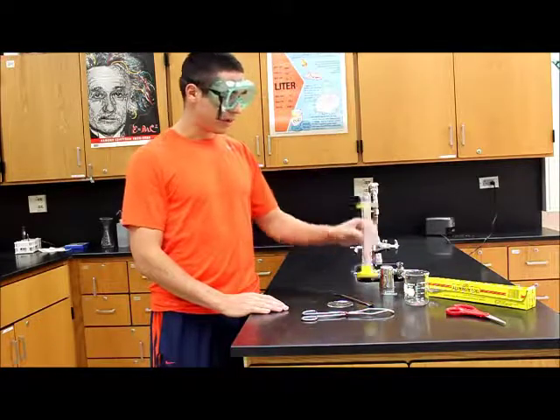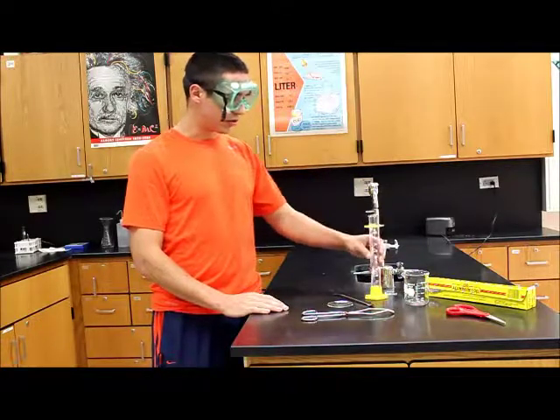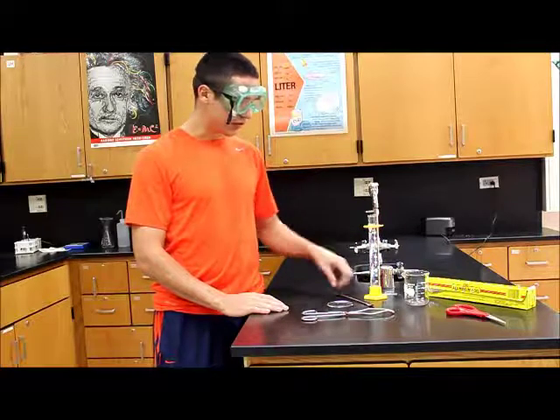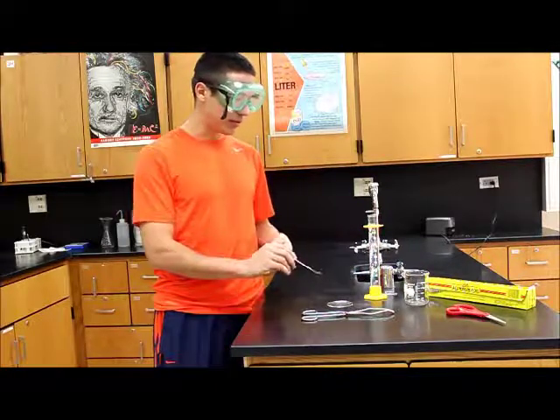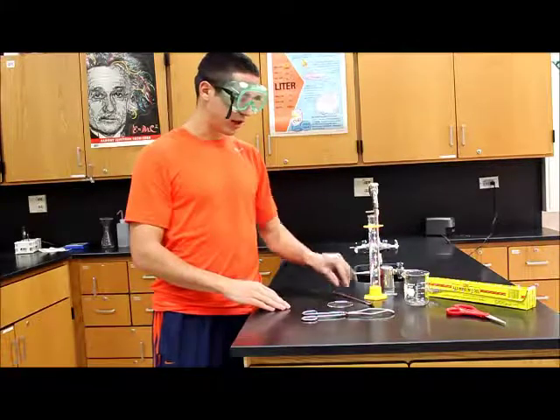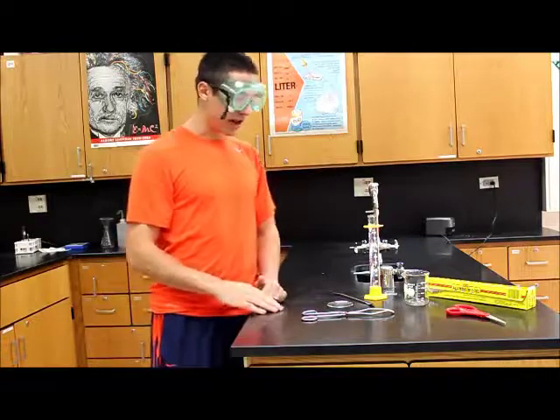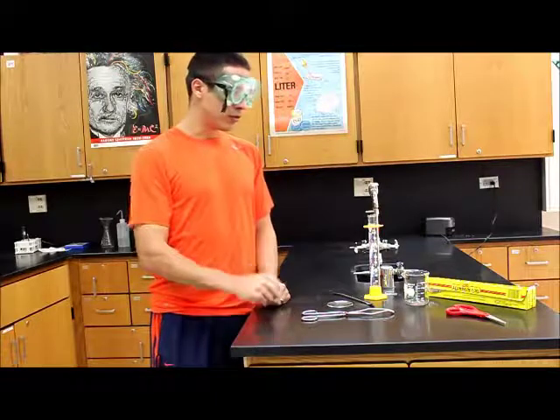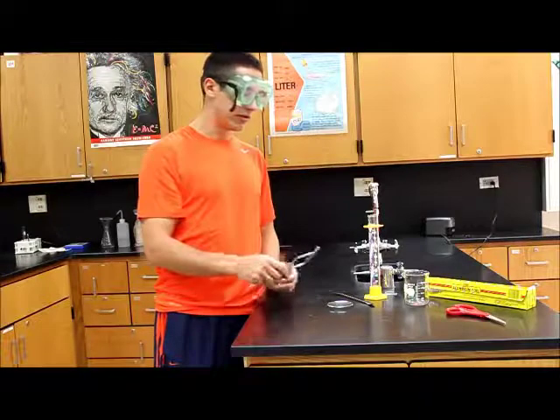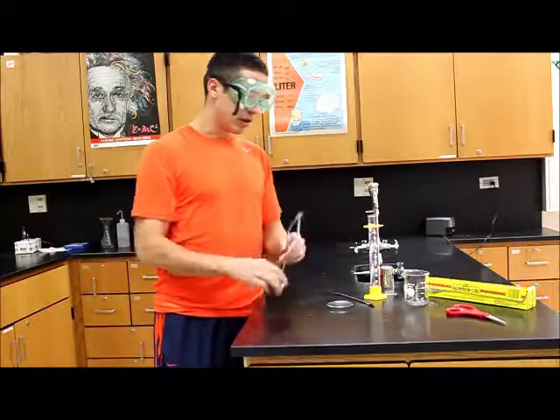We're going to have a 250 milliliter beaker where we're going to actually be doing the reaction. You're going to be adding some tap water to that. We have a 100 milliliter graduated cylinder to measure out the water. The exact amount of water is not really necessary but you want to make sure that you record that. We have a scooper so you can measure out the copper(II) chloride. And then the second day after you do the reaction you're going to be removing the aluminum foil from your solution using a pair of tongs.